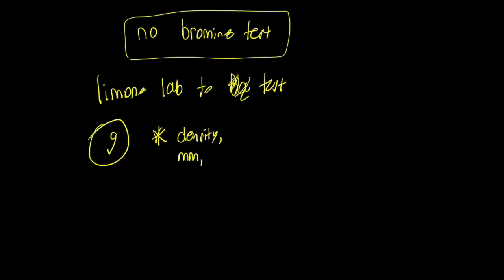And yeah, so again, we're not doing the bromine test. Okay, no bromine test, I mentioned. Yeah, I've already talked about that. So don't record that on your lab sheet. Just leave it blank or write not applicable or NA.